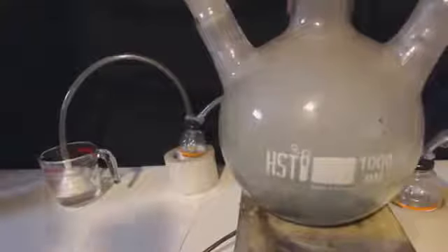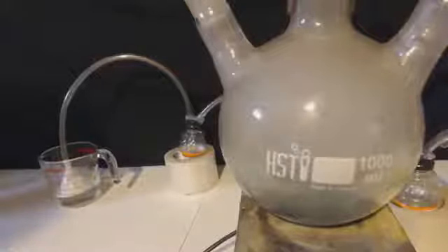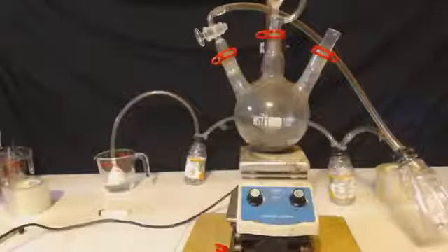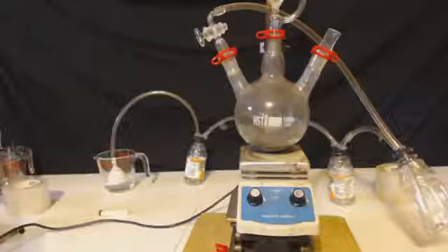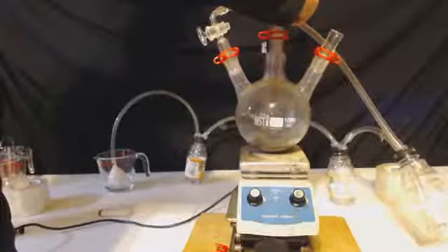Right now I'm running around like a chicken with its head cut off, trying to figure out what's going on here. There's that keck clip. See what it did there? It smashed it right in half when the cap blew off. Anyways, there's the culprit. I thought it was the bubbler I made. It was actually that little valve there. I forgot to open it. So it kept building up, making the hydrogen and building up the pressure.